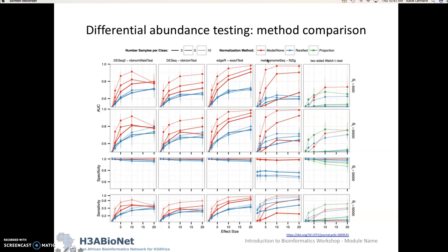And always just have a look at the output in a visual format like a heat map, which we're going to be doing as well downstream, to see that the results make sense and that you're not maybe getting positive hits that are driven by outliers in your data. For instance, for a given ASV, one group might have no hits, while the other group has a very small fraction, but with high abundance positive hits. This may result in a significant p-value, and these results should be filtered out, and we'll see how we do that downstream as well.